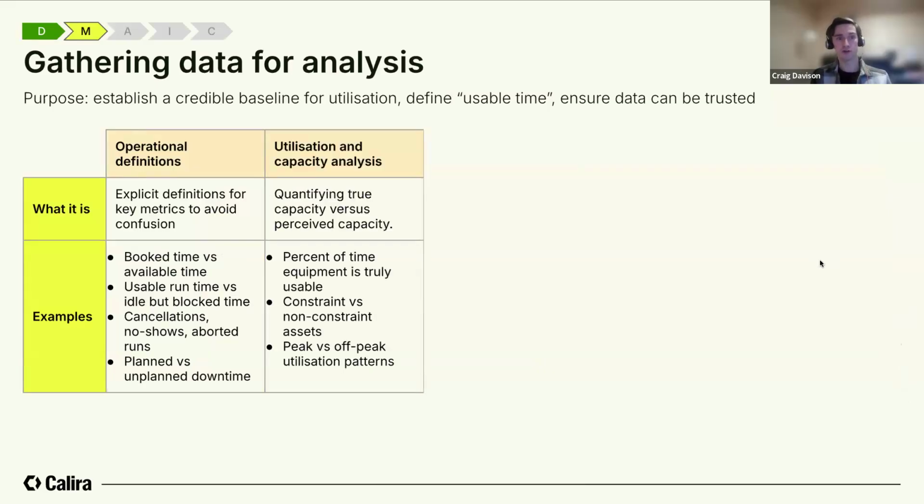These definitions are crucial and might be very specific to your types of labs. This is also crucial for what you ultimately want to quantify, such as the amount of time an instrument is actually usable. So, for example, maybe it requires frequent routine maintenance, and that takes up a significant amount of time. So the actual usable time for that piece of equipment would be less. You might want to focus your efforts on certain machines or areas of concern that you already know about.